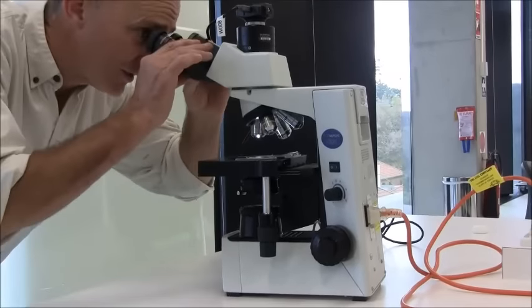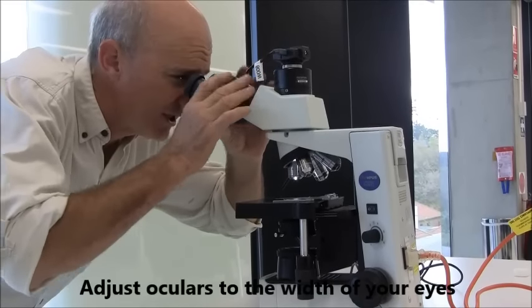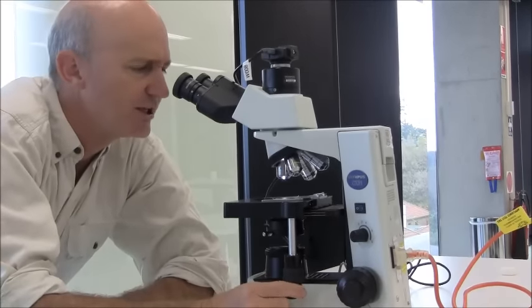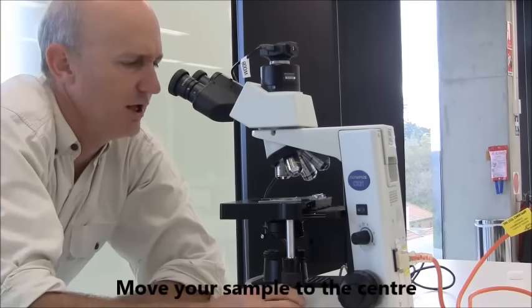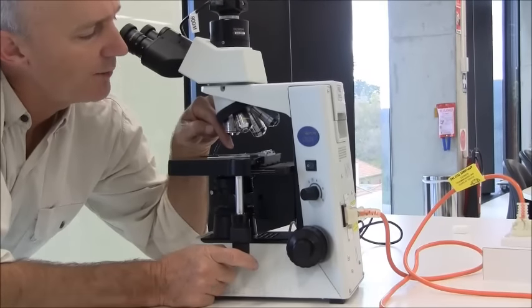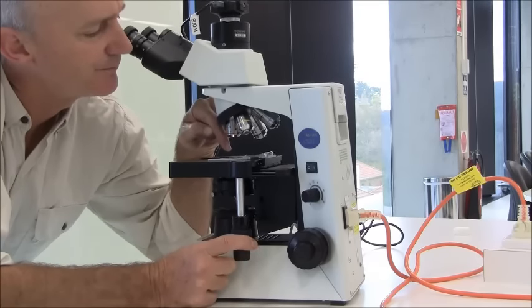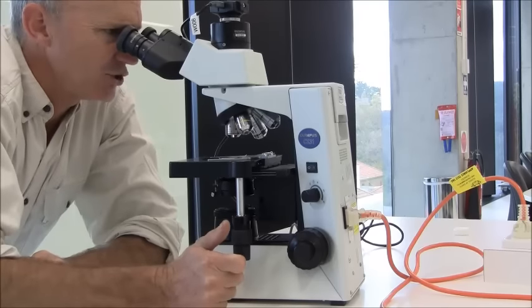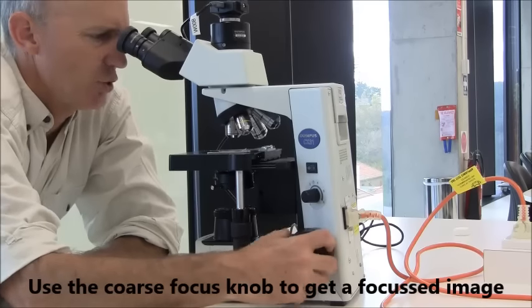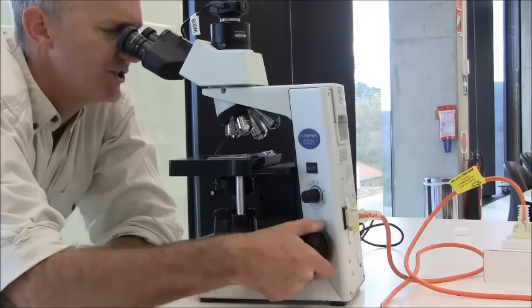Then you would adjust the distance between your two eyes, like so, so that when you're using your eyes, it looks like one circle. Now, using the stage manipulating controls, get the sample into the center of the light source. I'm not looking down the lenses, I'm looking at where I expect the sample to be, to position that in the center. Then, looking down the microscope, use the big knob to get it into focus. Now, you might need quite a bit of movement in the stage. It may be a long way out of the correct focal distance.